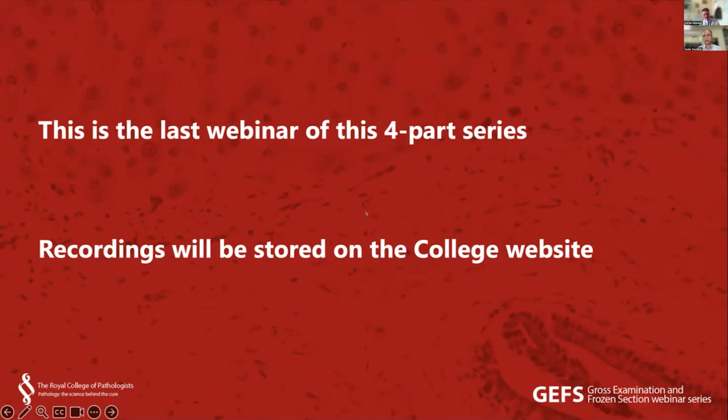And then, assuming you've done all that, I tend to sample in a systematic way, where you might, for a total colectomy, sample terminal ileum first, and then the ileocecal valve, and then I might sample maybe 10 centimetre intervals, longitudinal sections from proximal to distal, and then make a note in my block description whether any of the samples, maybe from the proximal colon, were from macroscopically normal bowel and which were from macroscopically abnormal bowel. And I will sample any focal lesions as well.